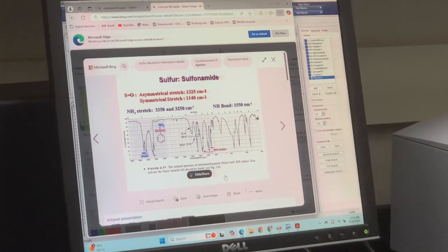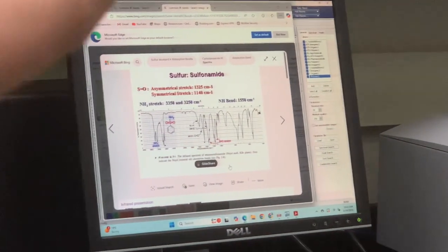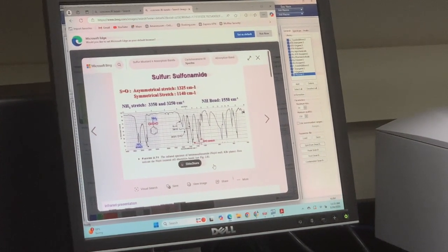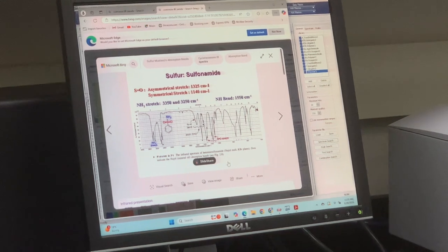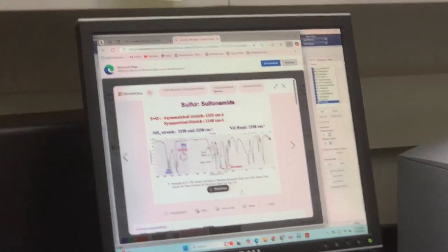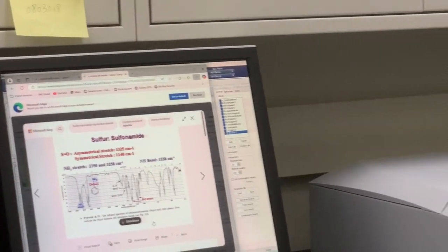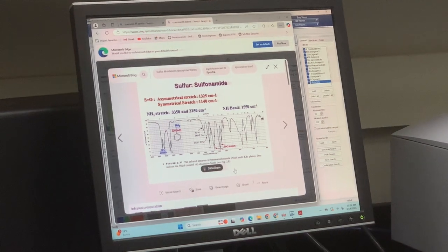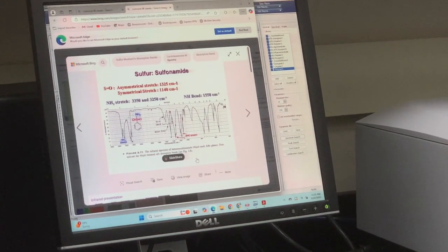You say it is difficult if there's, for example, Mohammed's project, with vanadium oxide and different types of vanadium oxide, like V2O5. When we are running through that sample, they have everything inside that sample, and it might have difficulty recognizing those 3 different materials. It may.